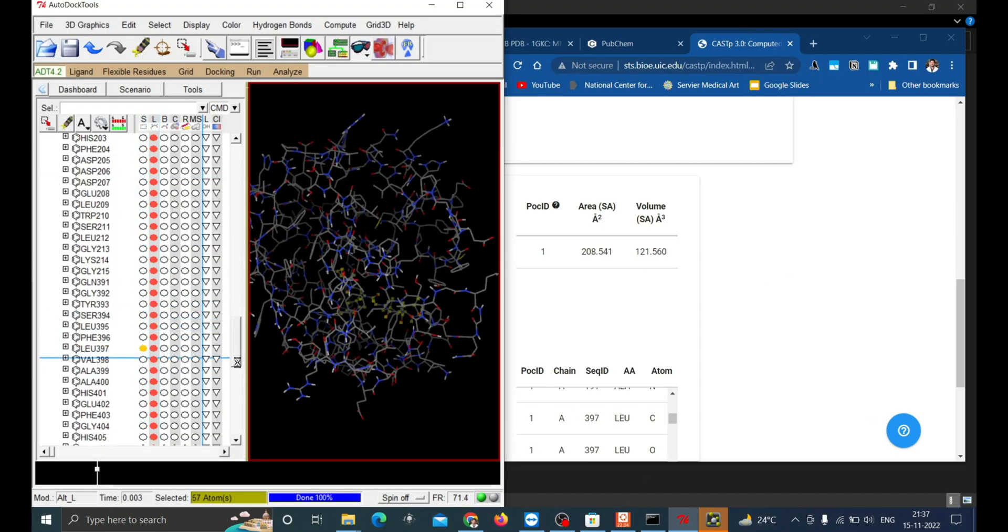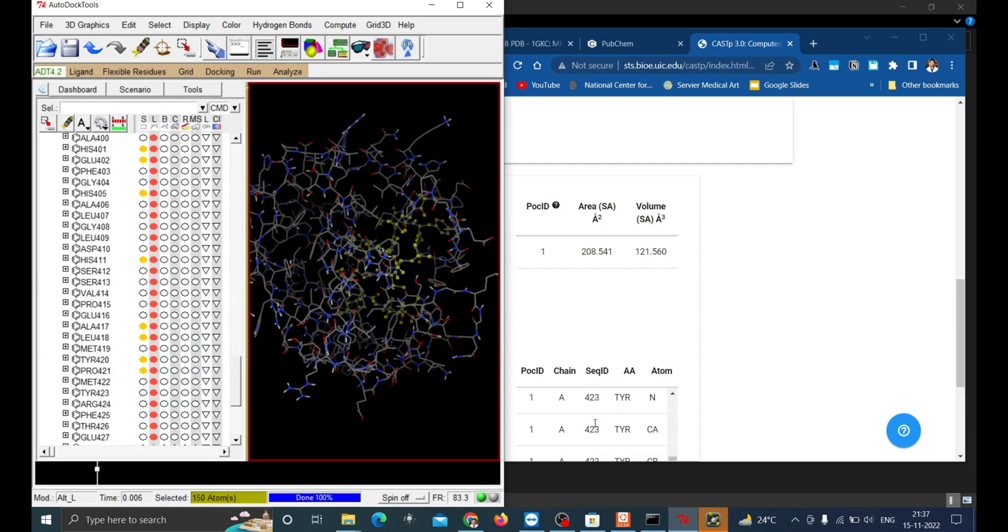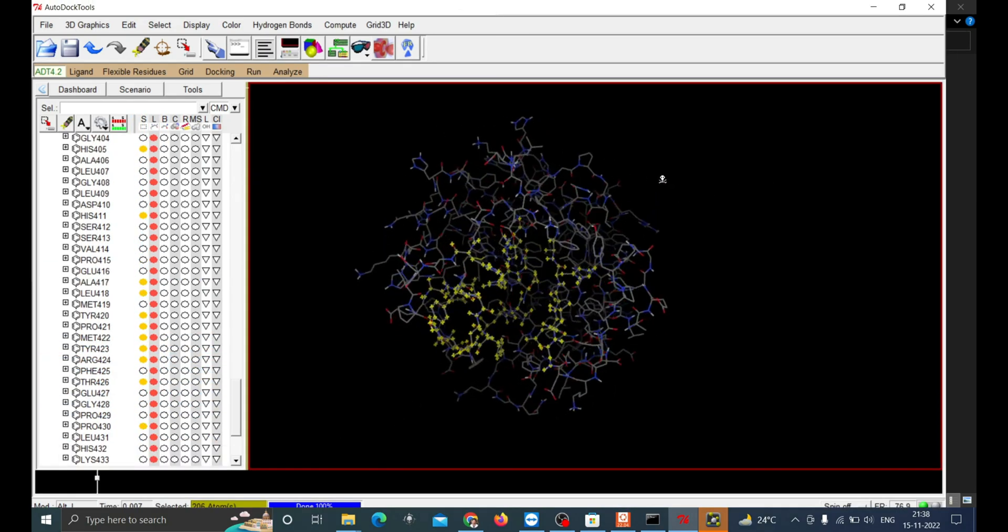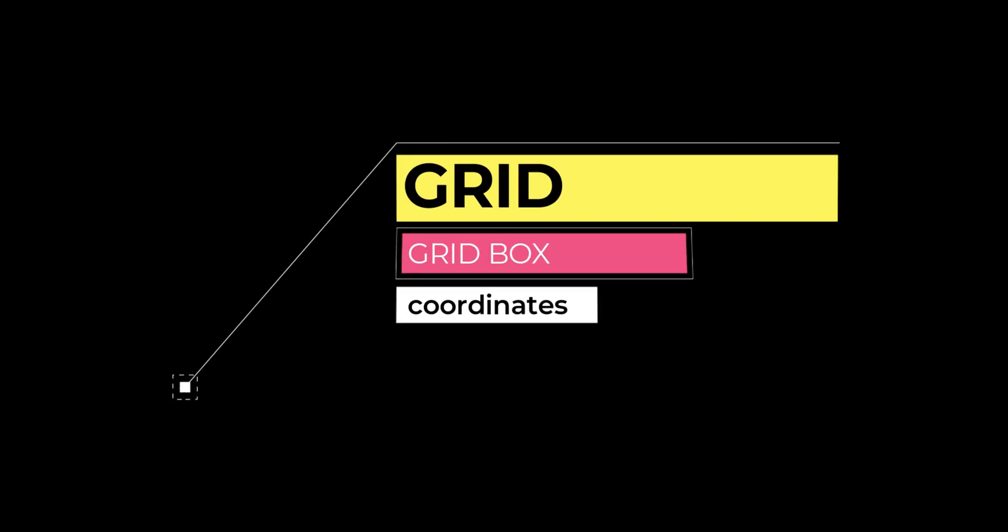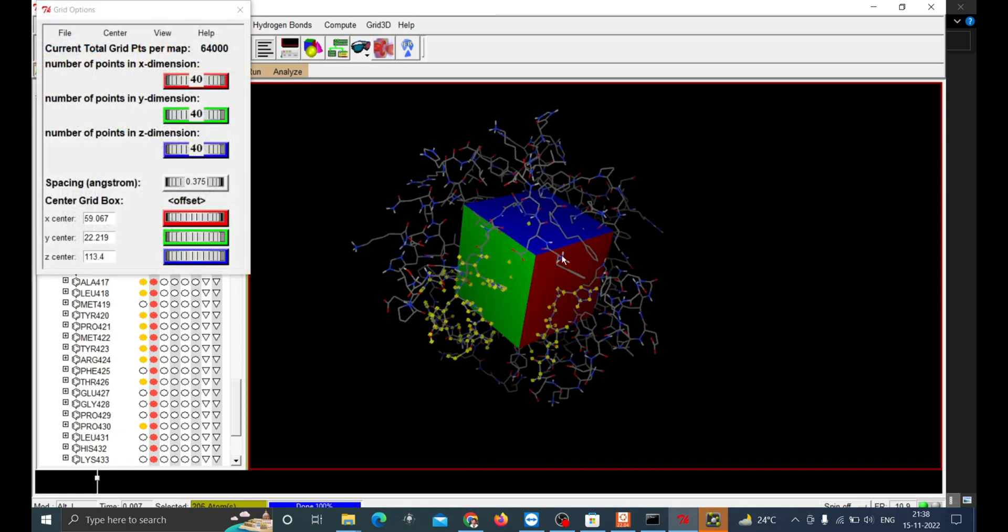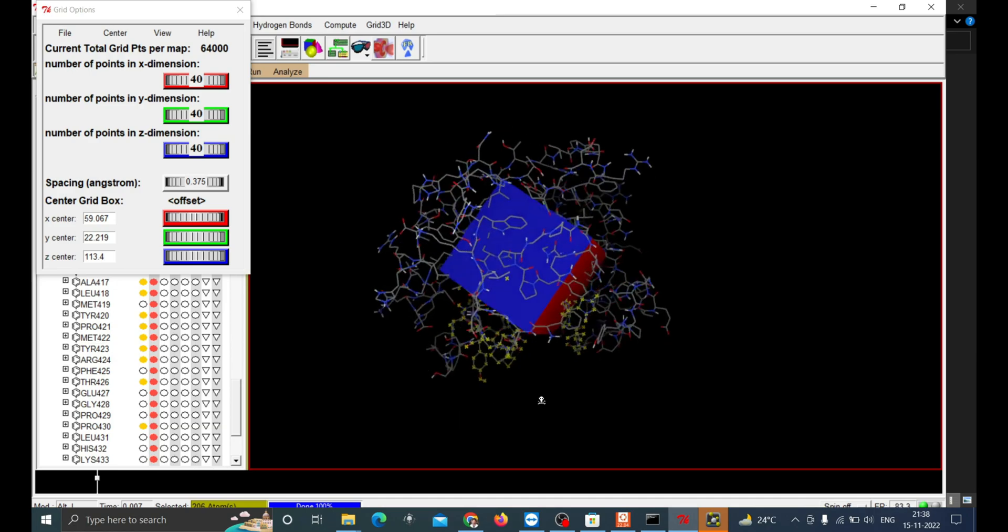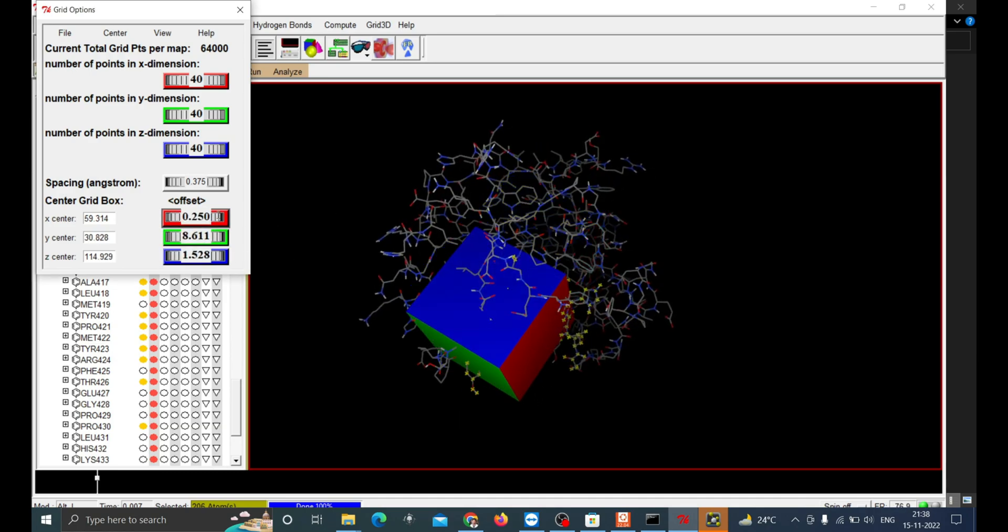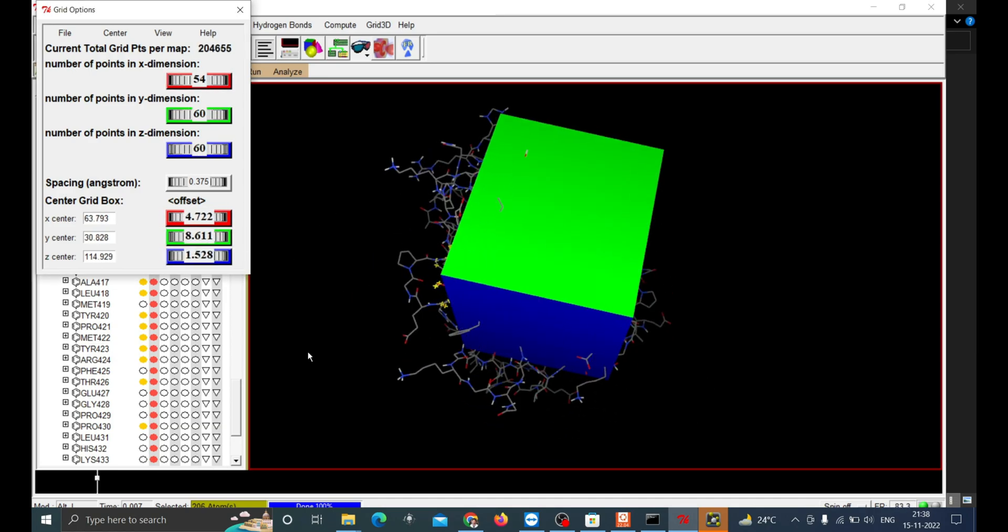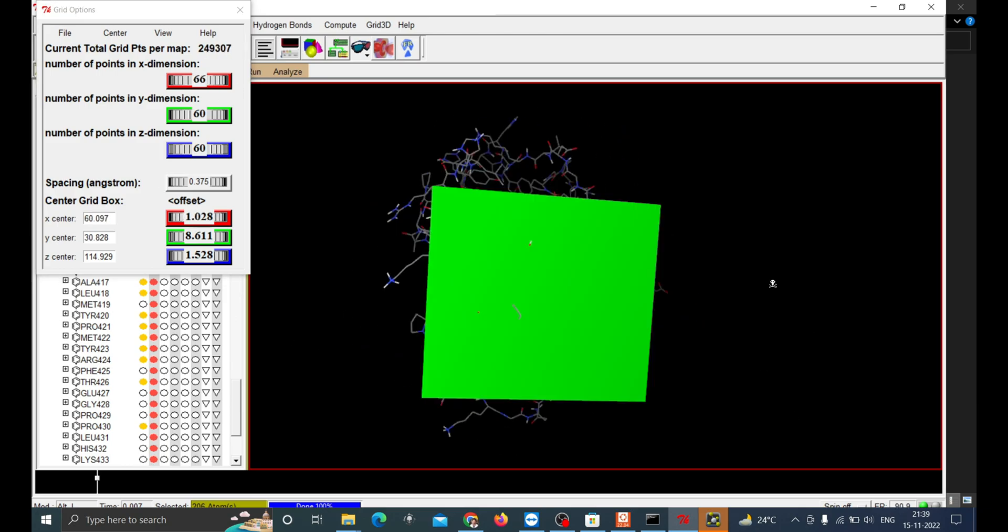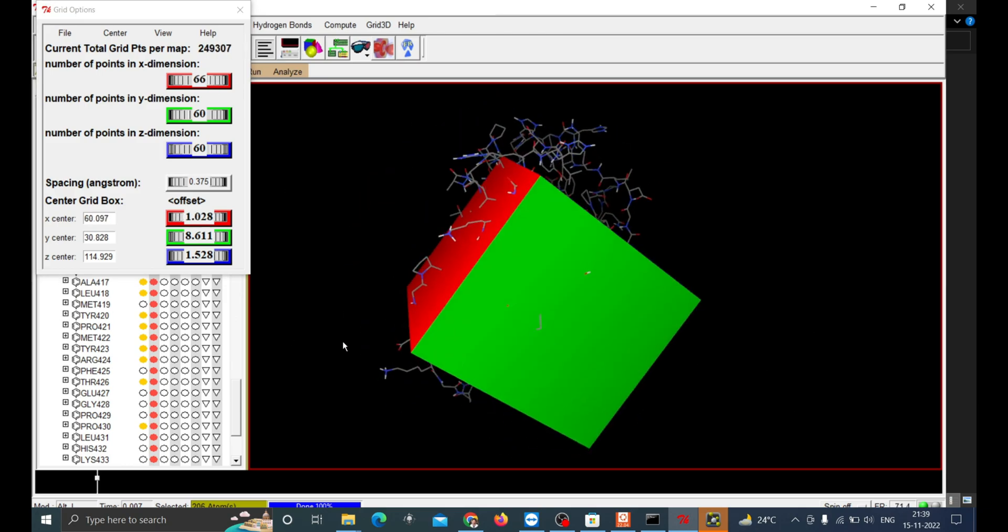Once all amino acids in the binding pockets are highlighted, the next task is to make grid configuration for running AutoDock. Now go to Grid and click on the Grid Box. Move and resize the grid in such a way that the binding sites are inside the grid. This X, Y, Z dimensions and coordinates will be used in the configuration file for AutoDock.